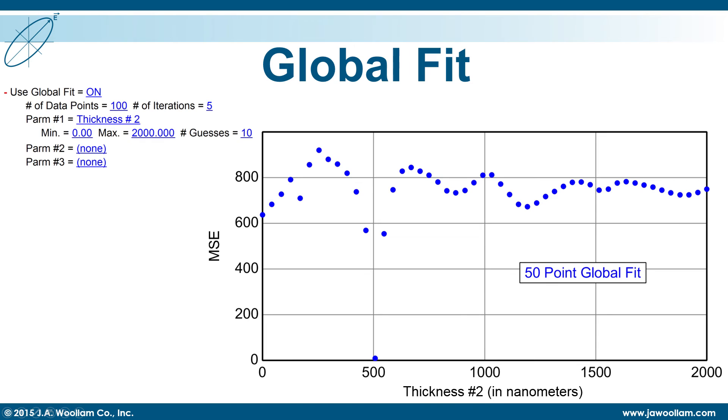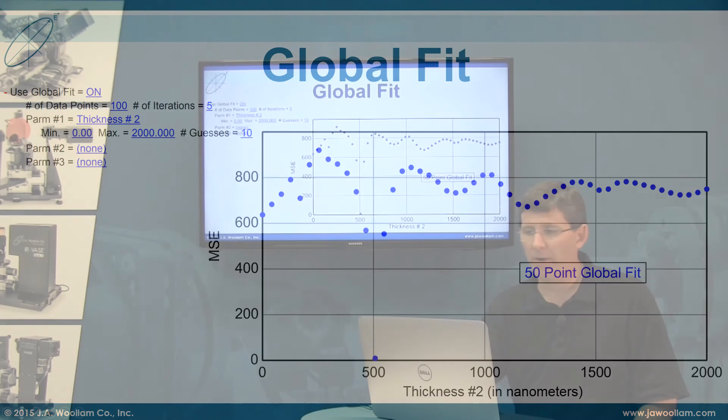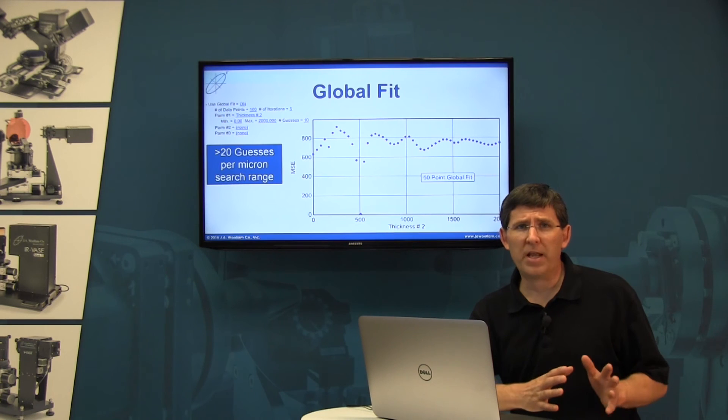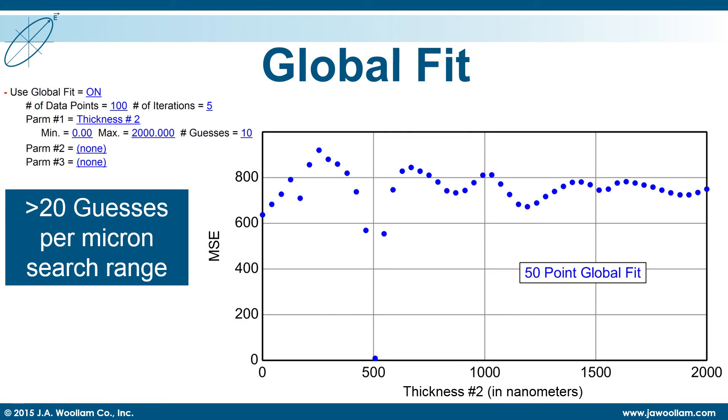The global fit works by searching the MSE at all 50 of those values, as I've shown on this graph here. Now as a general rule of thumb, I like to use at least 20 guesses for my thickness for every one micron that I'm searching over.